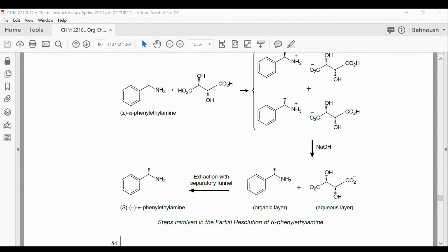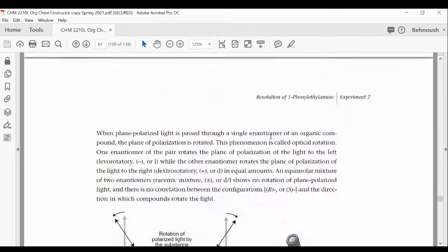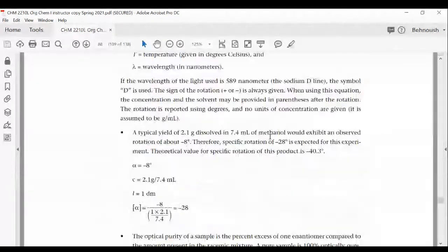After you have it in a separatory funnel, before you separate them, you are adding NaCl. NaCl lowers the solubility of the oil in water. So it would basically remove all the excess water from the organic layer, which is a good thing. And then you are going to drain it. There would be some moisture still left, and that's why you are using carbonate. Yes, that's what the salting out of the amine means. And then you are going to use the carbonate as the anhydrous agent. We go to the procedure.